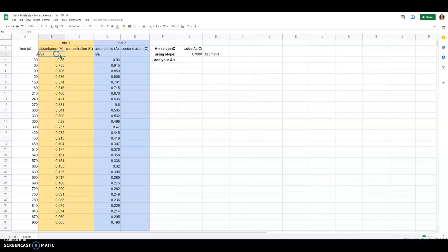Remember our initial concentration at time zero is not trustworthy for a couple of reasons. We didn't have the cuvette in the spectrophotometer, so whatever reading you got at time zero you want to delete that and not include it as part of your analysis.